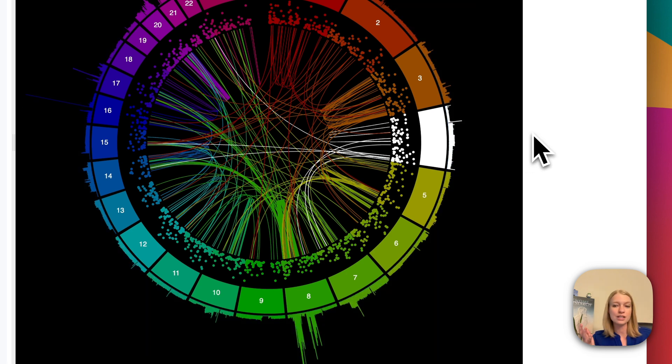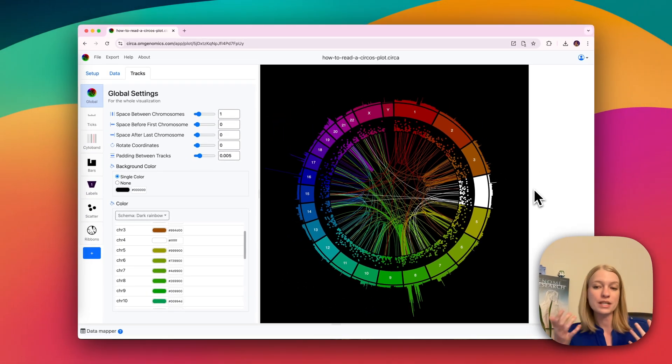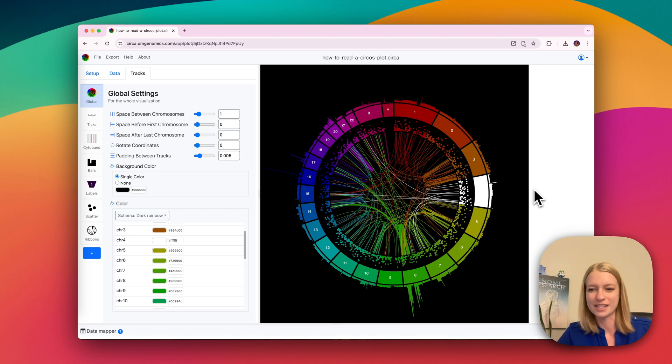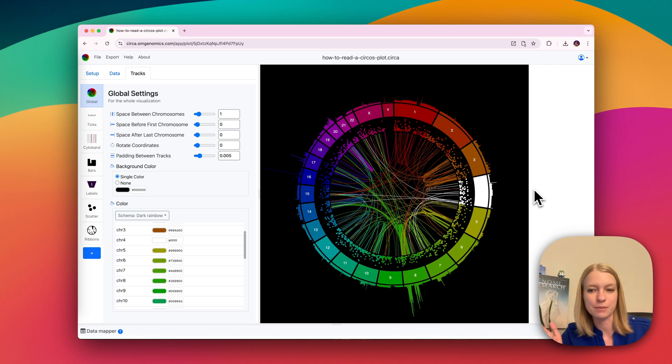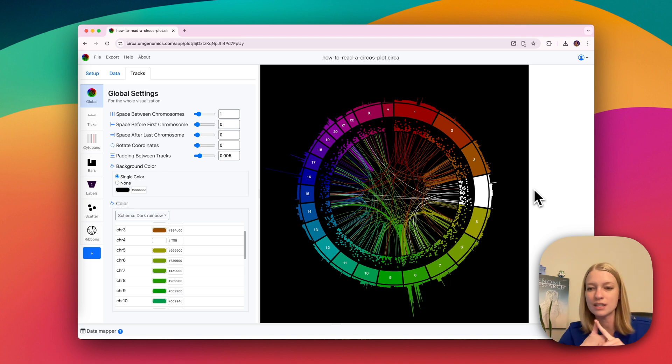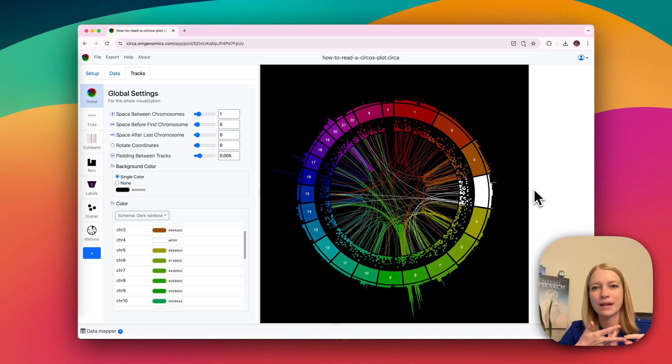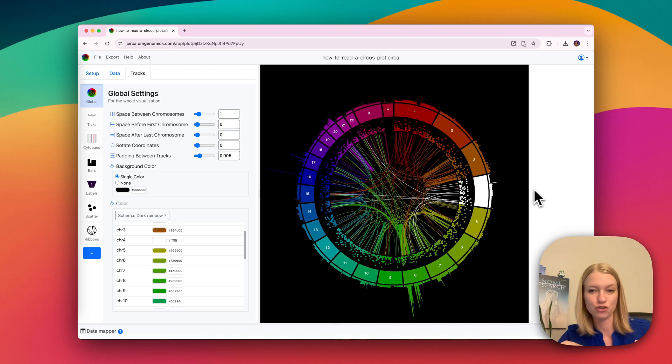Sectors can also be other things than chromosomes. They're almost always going to be some kind of genomic sequence, though, or transcriptomic sequence, perhaps. It'll usually be something you can measure in base pairs. So this could be gene sequences, it could be transcripts, it could be multiple bacterial genomes where you're comparing them against each other.